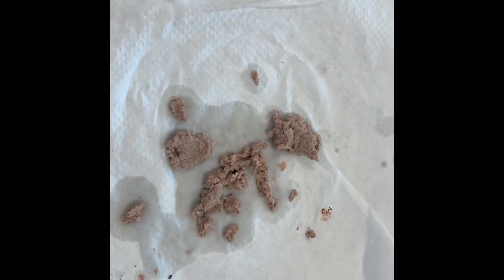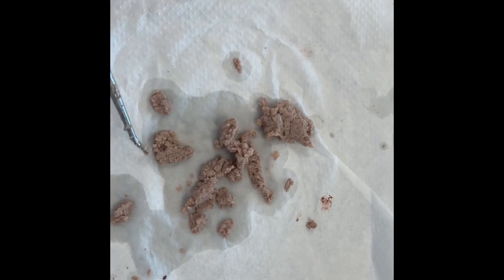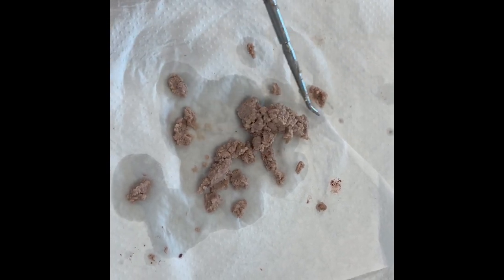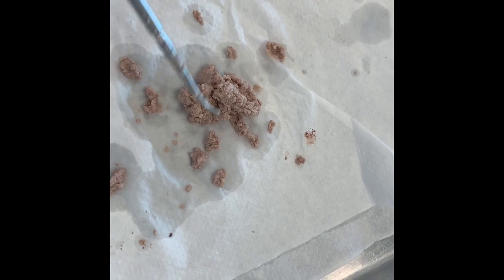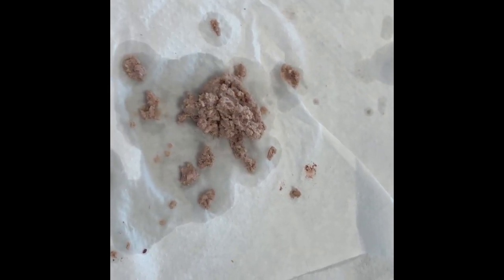Okay, so here we have the contents of the stomach. Not terribly exciting. Again, this is just dry cat food. And this is actually what chyme looks like. It's this kind of mashed up, ground up stuff. Not in a liquid state, but pretty soft and malleable.